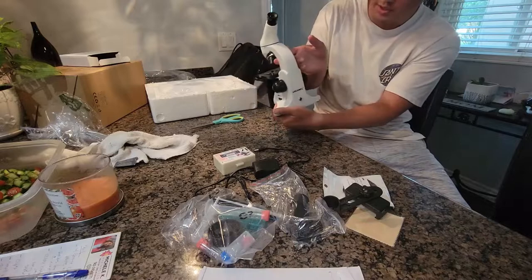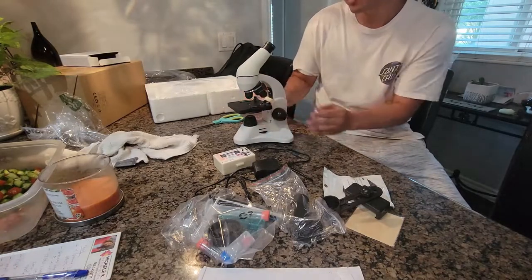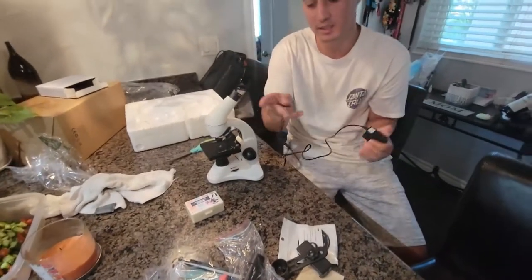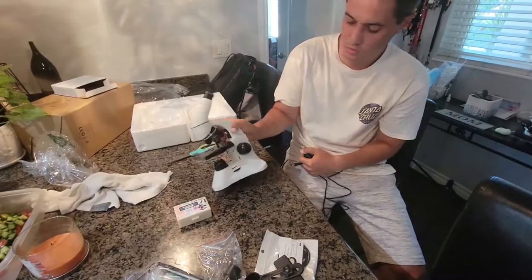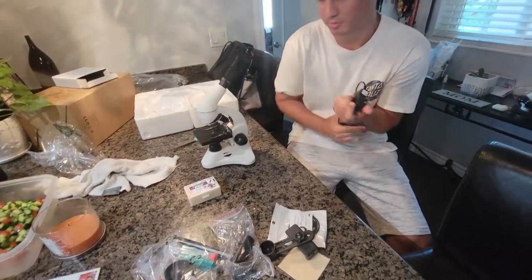Check out this microscope. It's a nice, small, portable microscope, and it comes with a lot of stuff. It comes with a plug to plug it in, or you could use two AA batteries — whatever you prefer. I prefer to plug it in.